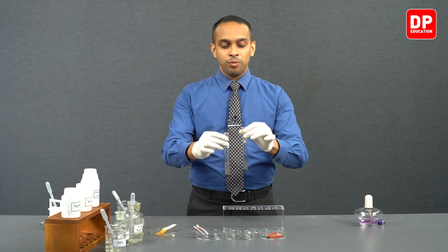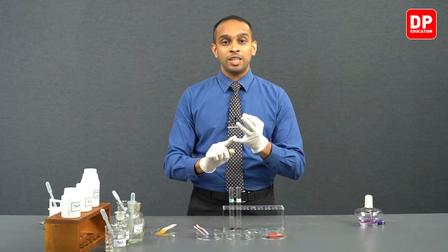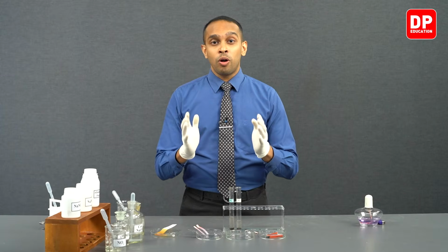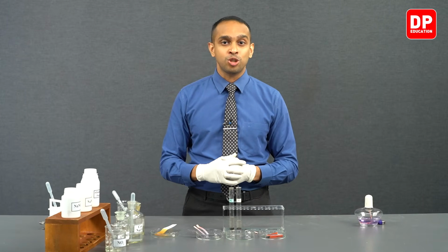Now students, with this observation, we conclude the tests that can be done to identify the presence of nitrate and nitrite ions. Let's take a look at all the identification tests that we conducted for nitrate and nitrite ions. Later on, we observed if you try to oxidize nitrite ions with the use of strong oxidizing agents such as acidified potassium permanganate or acidified potassium dichromate, nitrite ions can get oxidized further to form nitrate ions.